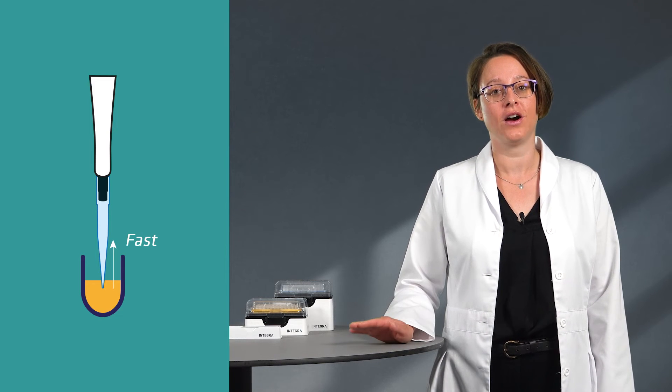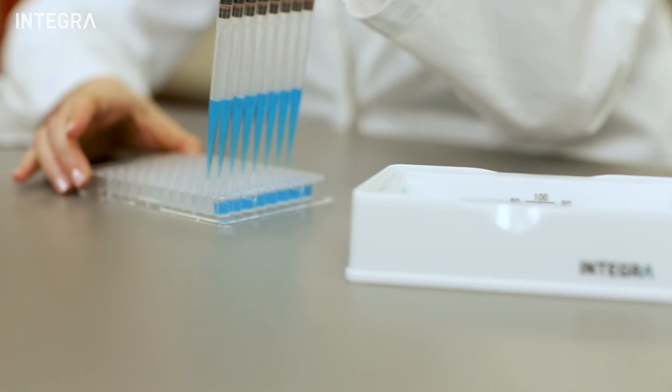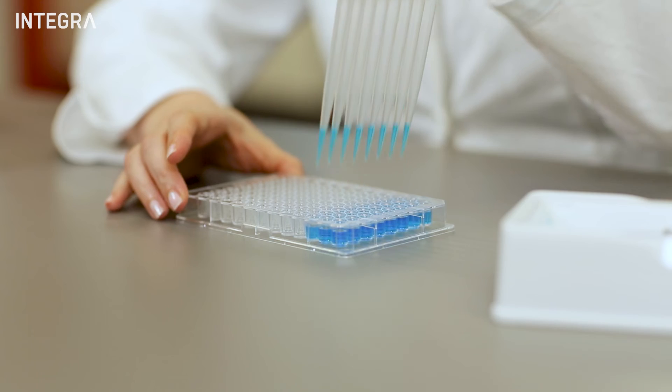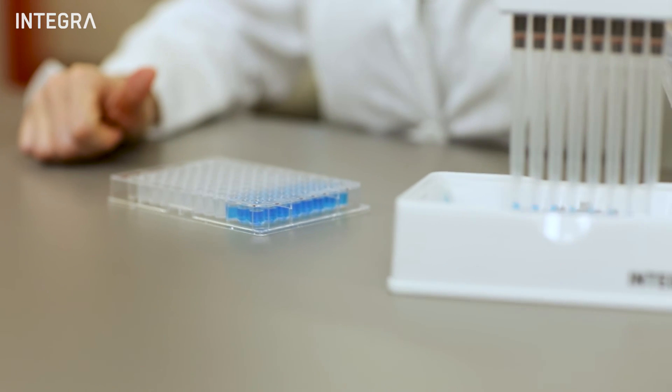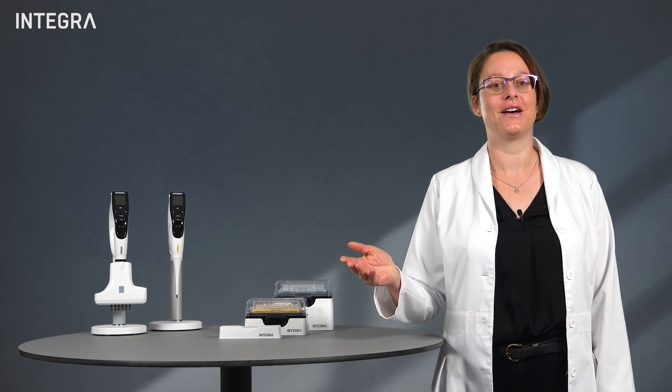Pipette into the target vessel as quickly as possible. Reverse pipetting or discarding a waste dispense after you have finished pipetting is also a technique which can be implemented with volatile liquids, if results are important.